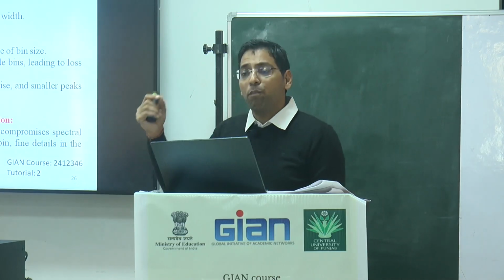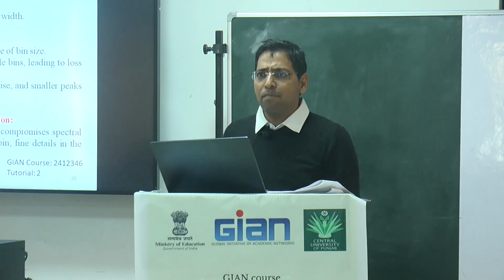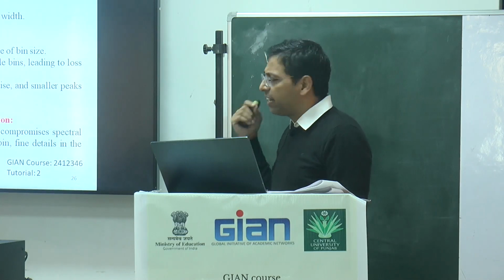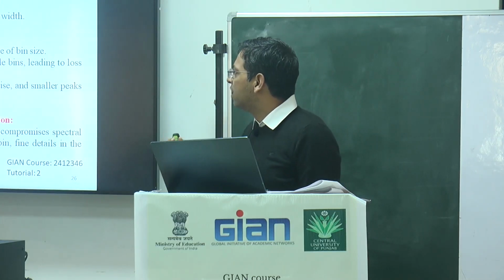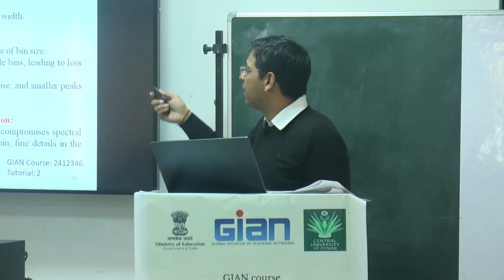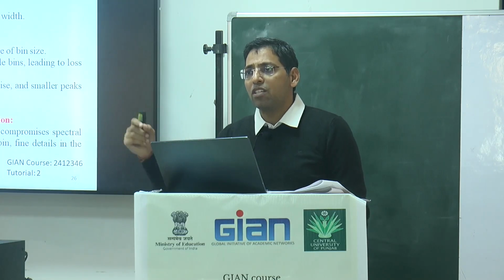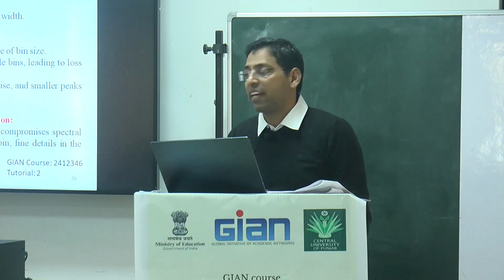So when you plot this graph of each and every peak, you will get some matrix, with one axis MZ and another axis retention time. Finally, you are dividing the scale of the MZ into small segments that are labeled as a bin of a specific width size.